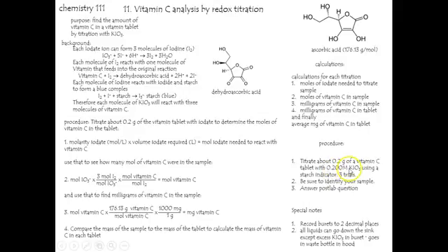Put some 0.2 molar potassium iodate into your burette, drip that stuff in till it turns blue, record it to the 100th of a mil, that's 2 decimal places. Do this for 3 trials, hope you get nice close agreement, that's always a good sign. Be sure to identify your sample, run your calculations in class before you leave, and answer the post-lab question. A lot of students, well, not a lot, but I always get 1 or 2 that just forgot about that and they end up getting a 0 for 5 on the post-lab.